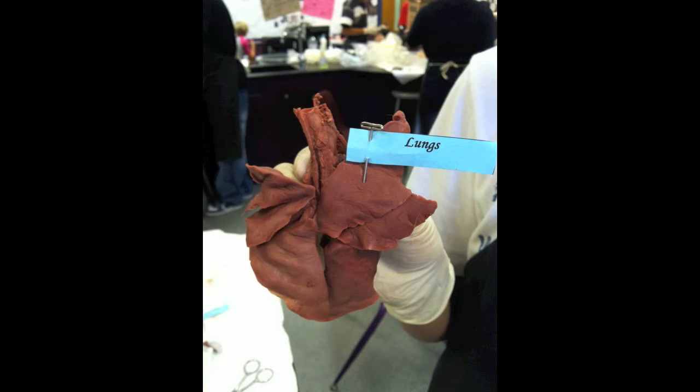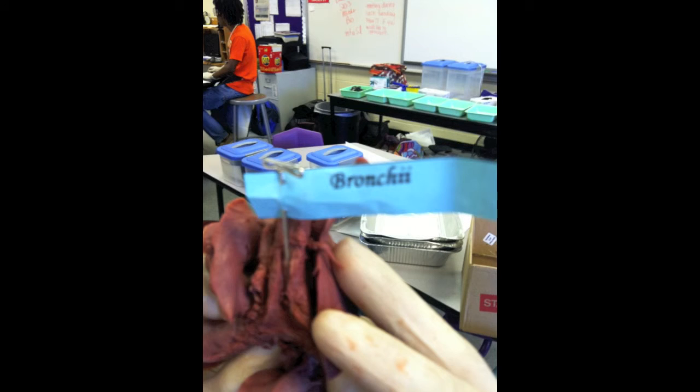The lungs transport oxygen from the atmosphere into the bloodstream and release carbon dioxide from the bloodstream into the atmosphere. The bronchi transport oxygen from the trachea to each lung.